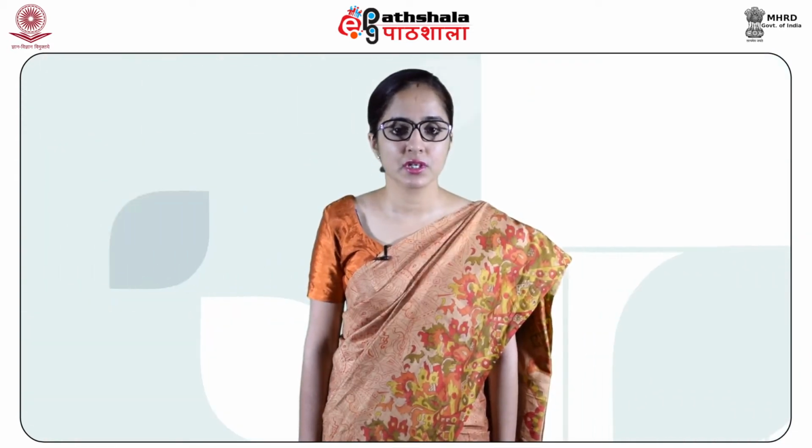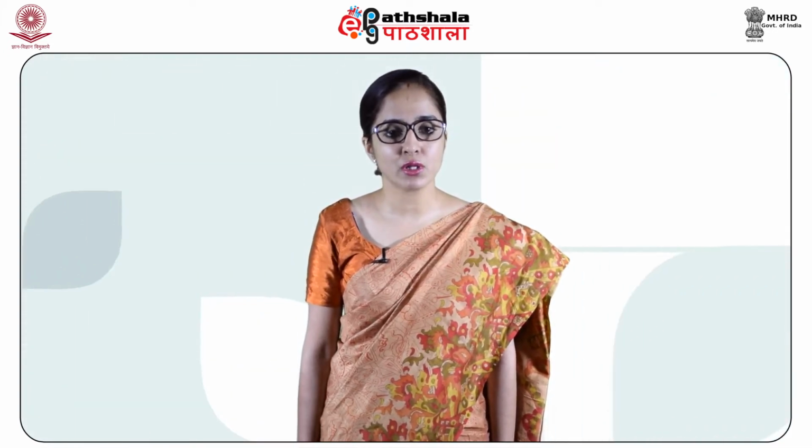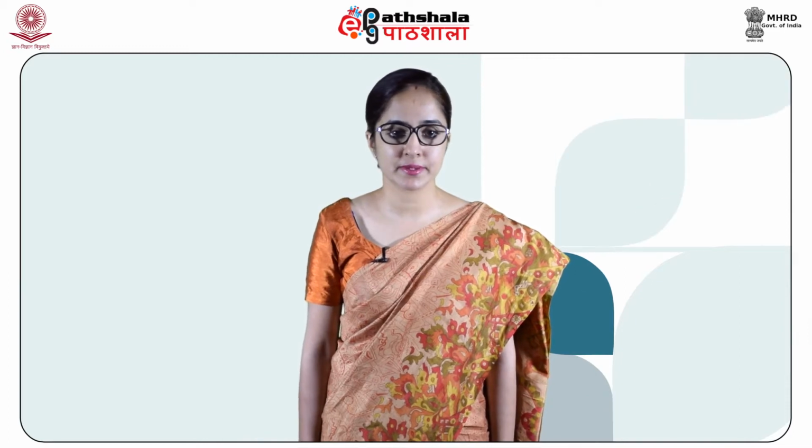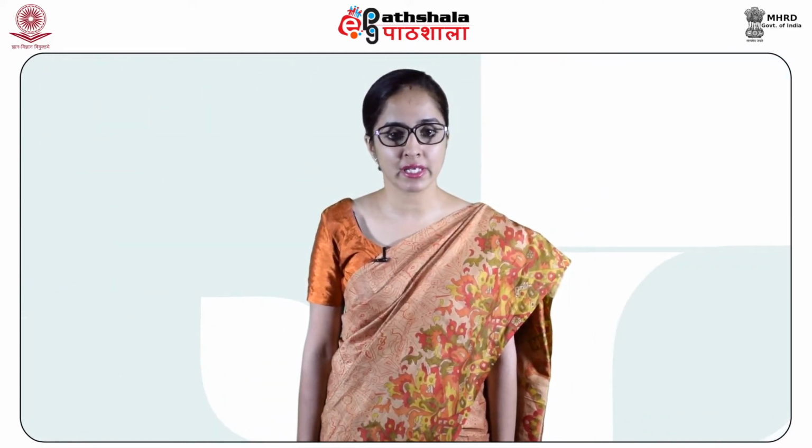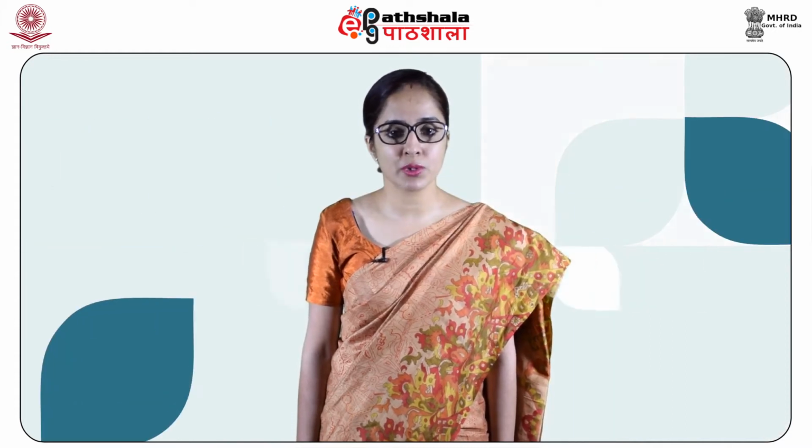Dear students, today in this module we would like to tell you how infrared spectroscopy goes beyond, being used not only by organic chemists but also in many other fields. Infrared spectroscopy is a simple and reliable technique which is widely used in both organic and inorganic chemistry. It is also used in quality control analysis in industrial, scientific and medical applications.